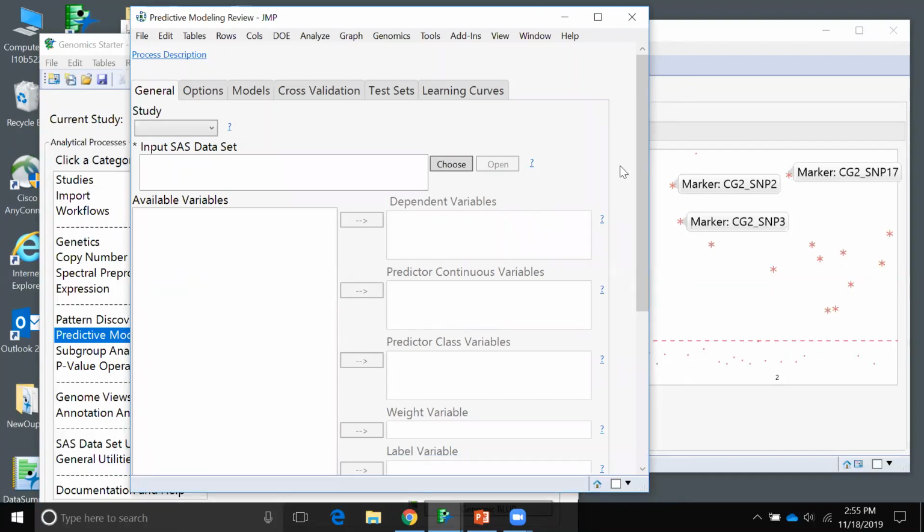Yeah. So we will change it to the 012 format. Sorry, I'm answering this out of order, but the 012 format is required for JMP to run these analyses actually in SAS in the background. Because we're going to give you a couple of options when you have genetic data, and one of them is a Cochran-Armitage trend test, and for that we need it to be 0, 1, and 2.